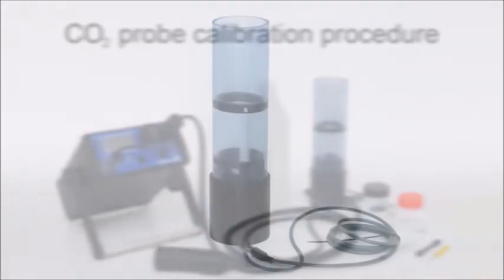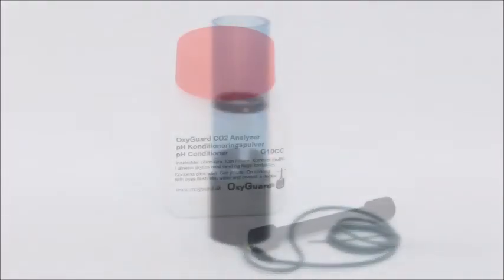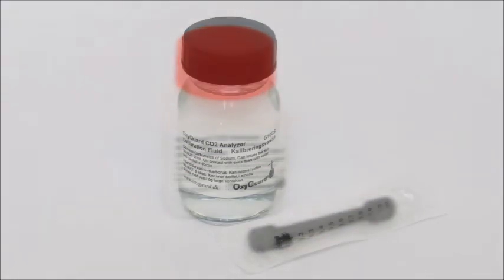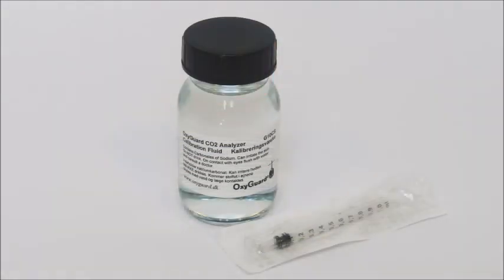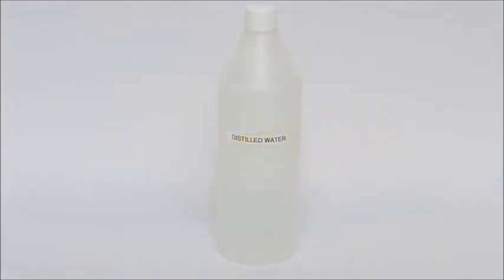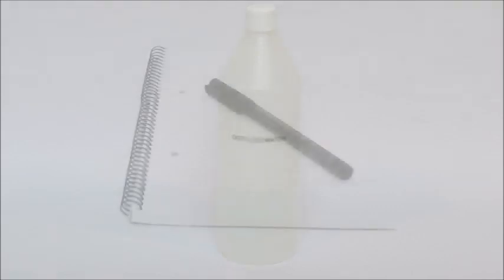A calibration beaker with stirrer, a pH conditioner and a measuring spoon, a calibration fluid and a dosing syringe, a little screwdriver, distilled water, a piece of paper and a pen.